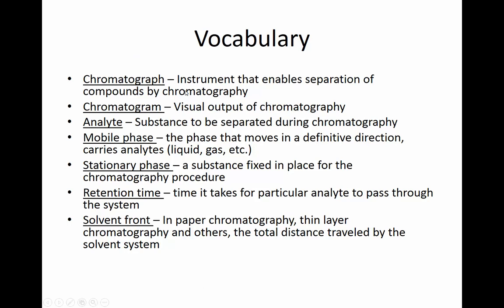Now we won't really be using a chromatograph. If you want to see a chromatograph, you can look at my lab. I have two what are called HPLCs, and those are chromatographs. These are instruments that enable the separation of compounds by chromatography.